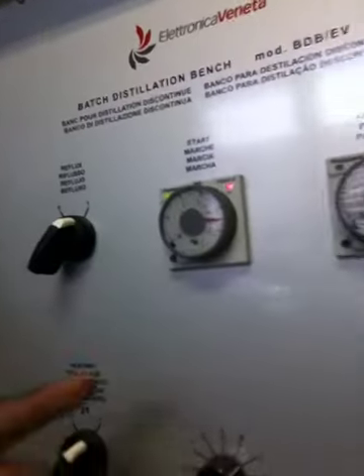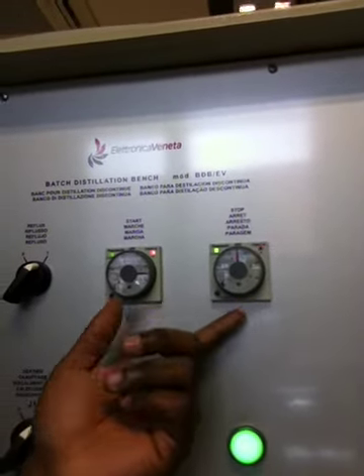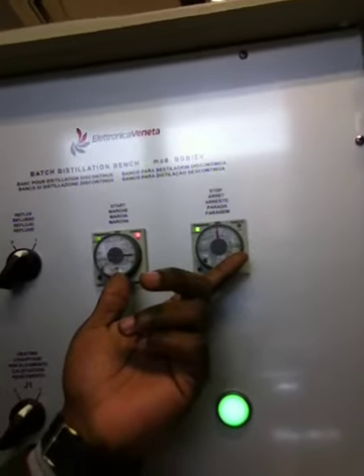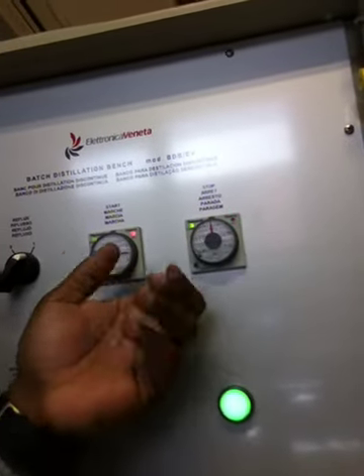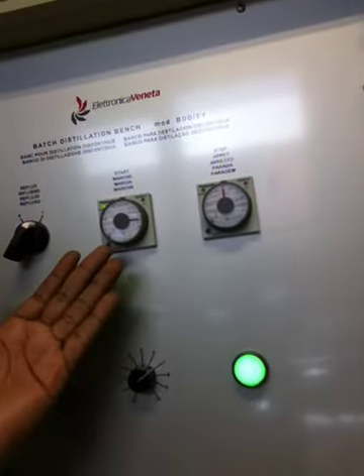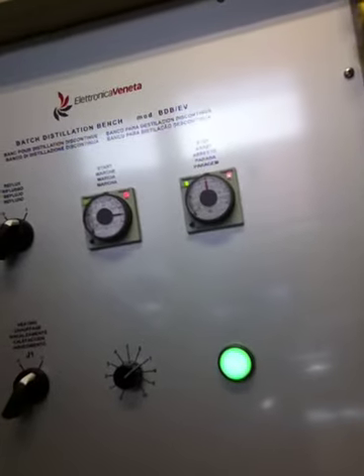So going back a little bit, you find that it's very important, and it's adjusted into range, and you can see the unit is specified in seconds. So both have to be adjusted according to the time that is given. Approximately we use 45 seconds so they can function accurately in the right manner.